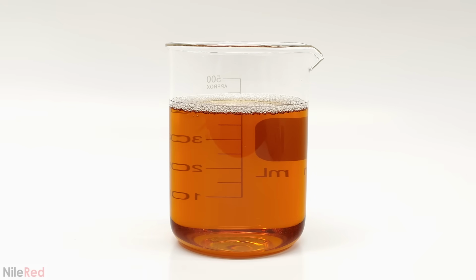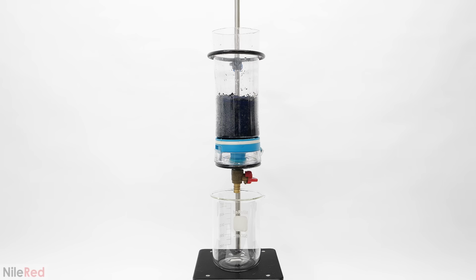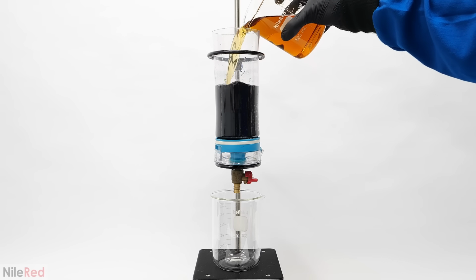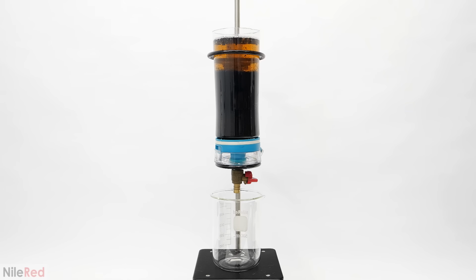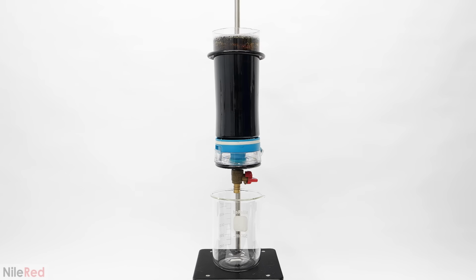This unfortunately meant that I had to go back to the ion exchange resin. This time, though, I did it in a different tube that I made from a water bottle. This one had a valve at the bottom that I could close so everything wouldn't pass through right away. I also included a bunch of activated charcoal along with the resin, which I was hoping would help with the smell and color. After everything was added, I stirred it around, and then I let it sit there.